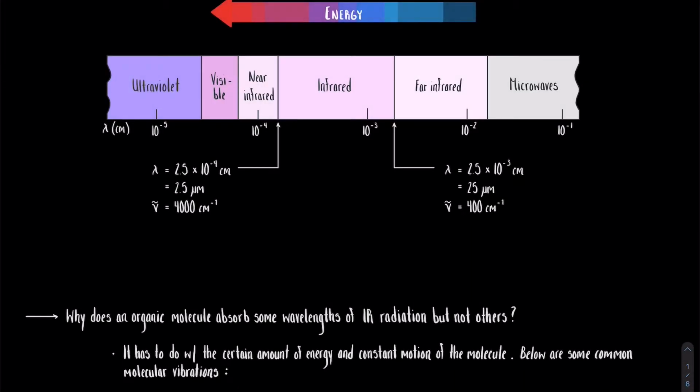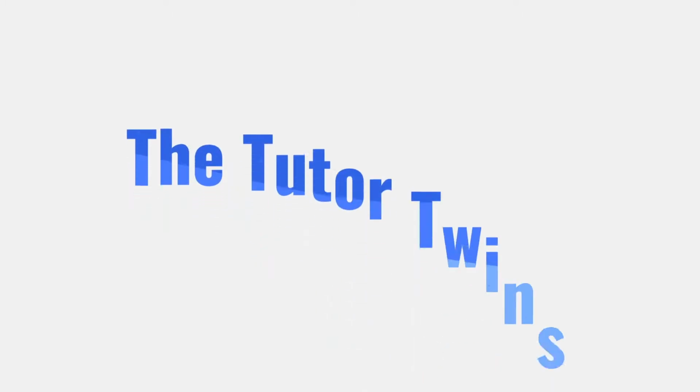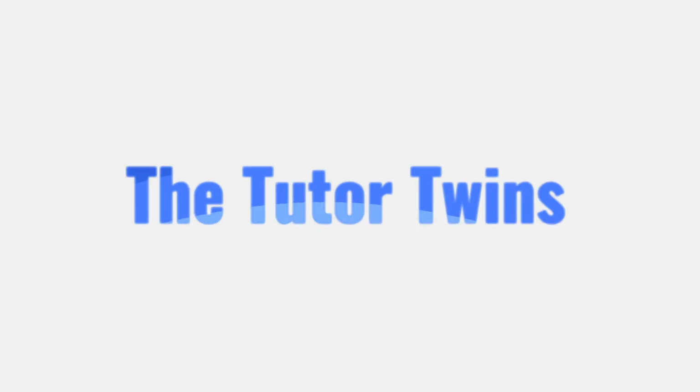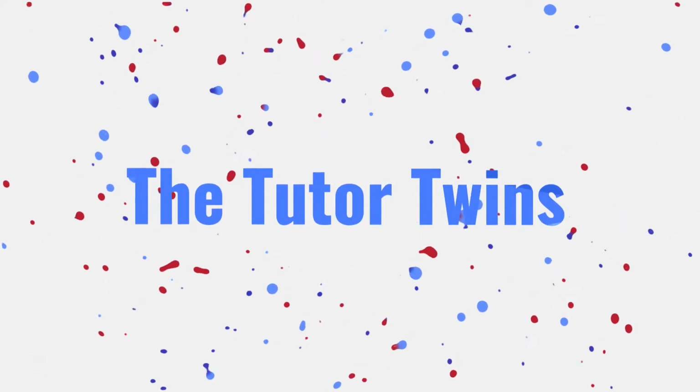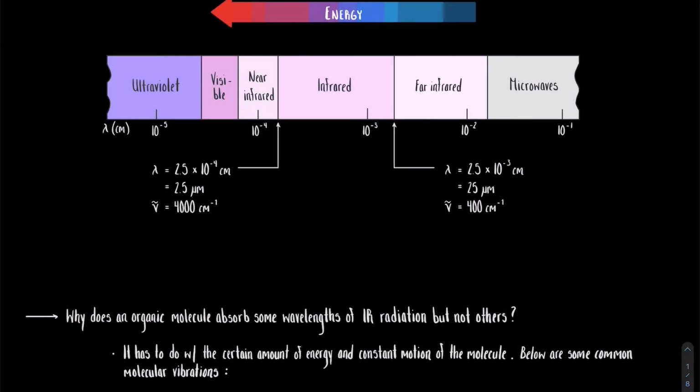In this organic chemistry video, I will be discussing spectroscopy and the electromagnetic spectrum. As an organic chemistry student, the four kinds of analytical techniques that you're going to come across include infrared, ultraviolet, and nuclear magnetic resonance spectroscopies, as well as mass spectrometry. Infrared, ultraviolet, and NMR differ from mass spec in that they are non-destructive and involve the interaction of molecules with electromagnetic energy rather than an ionizing agent, such as electrospray ionization.